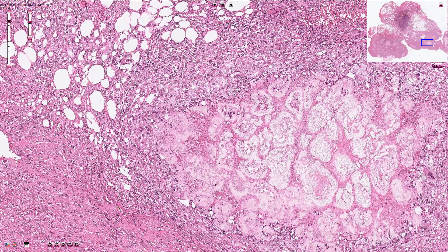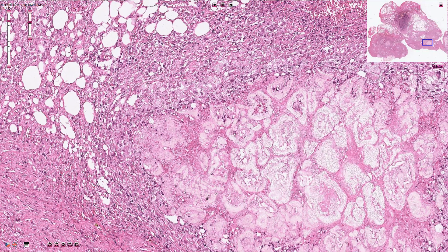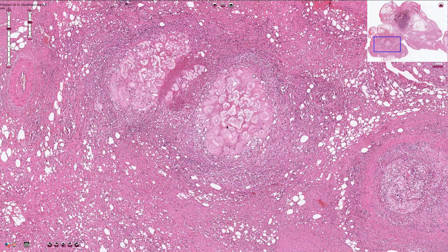Sometimes we can find small foci of calcification, which occurs via the process called saponification. The free fatty acids react with calcium and create calcium salts — a chemical reaction similar to soap production.